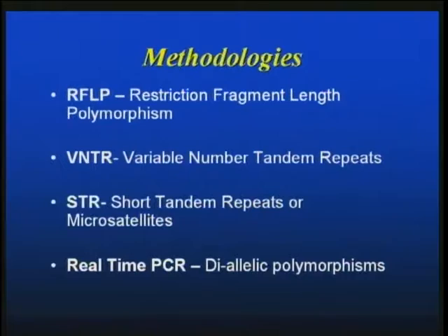They extend from a single nucleotide to 7 or 8 nucleotides. And that's what we work with in the lab. And so that's what I'm going to be focusing on.